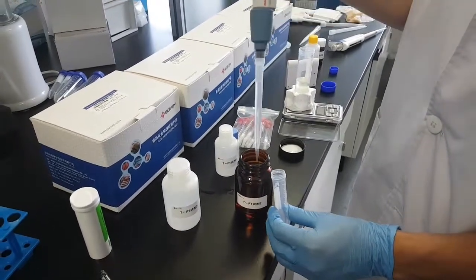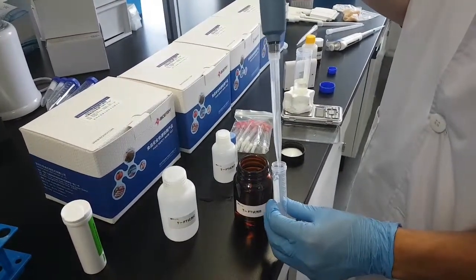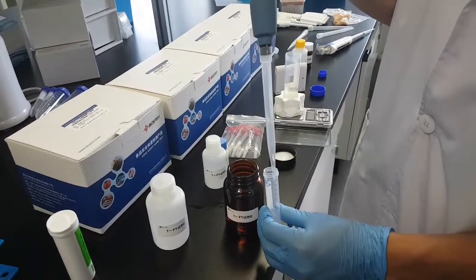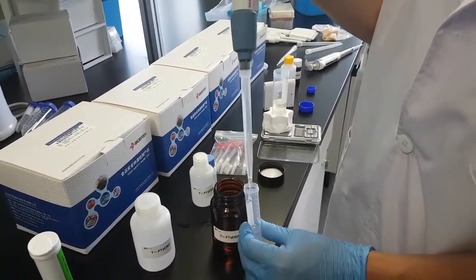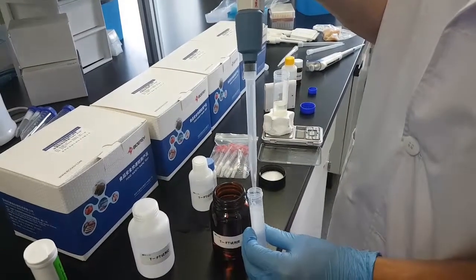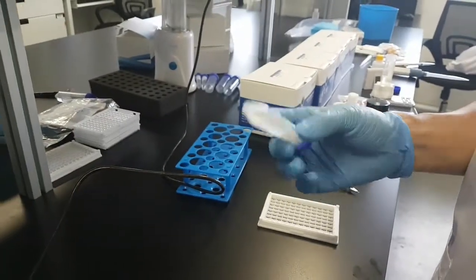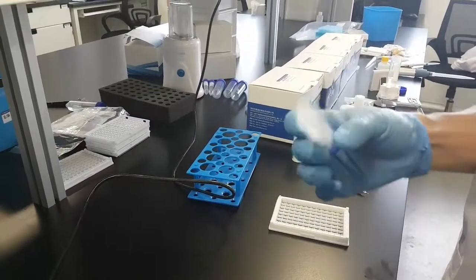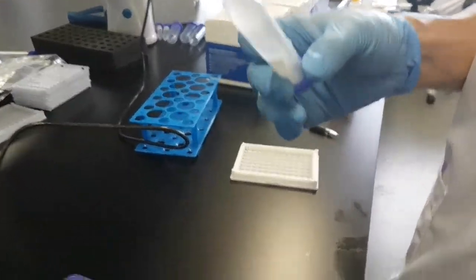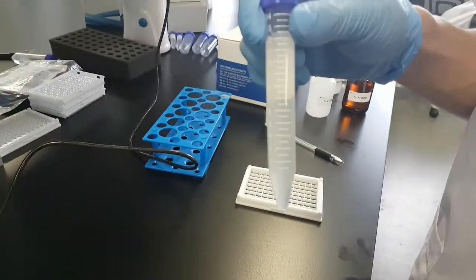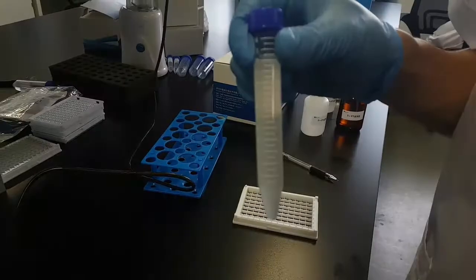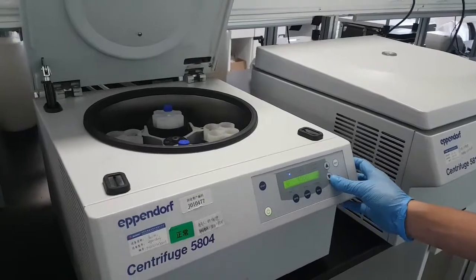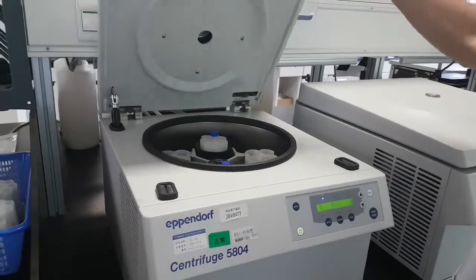Now we will take 10 milliliters of reagent E and put it into the same centrifuge tube. Mix up and down for four to five times and as we can see again, I would like to remark we see only the supernatant. Centrifuge for one minute at 4,000 rpm.